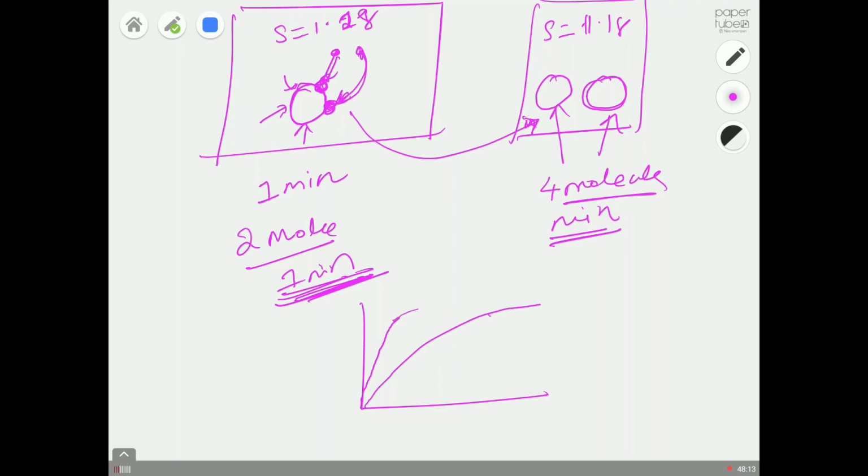and then it will eventually slow down because your supersaturation is getting consumed much faster, and the kinetics will decrease after some point. So try to put this reason in the discussion part. Your experimental part should be extremely strong, your working principles about your instrument should be extremely strong, and the introduction should be extremely strong.